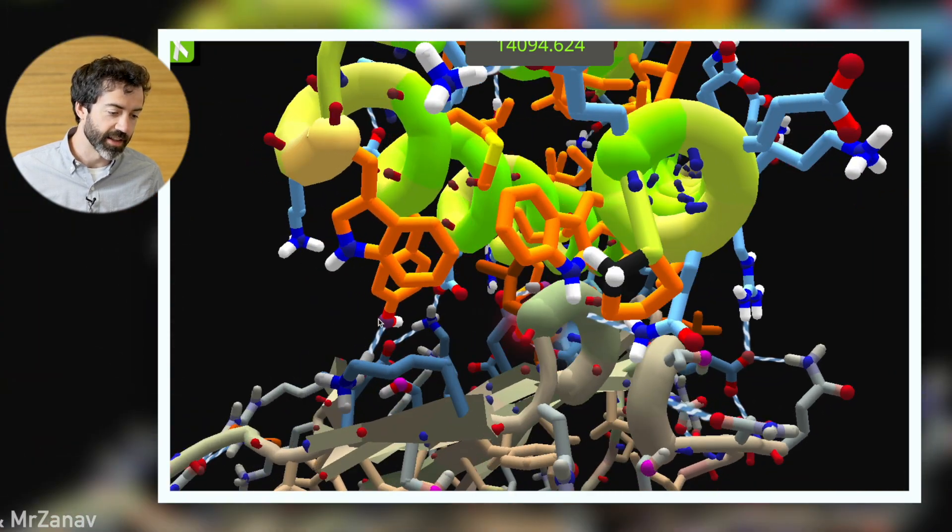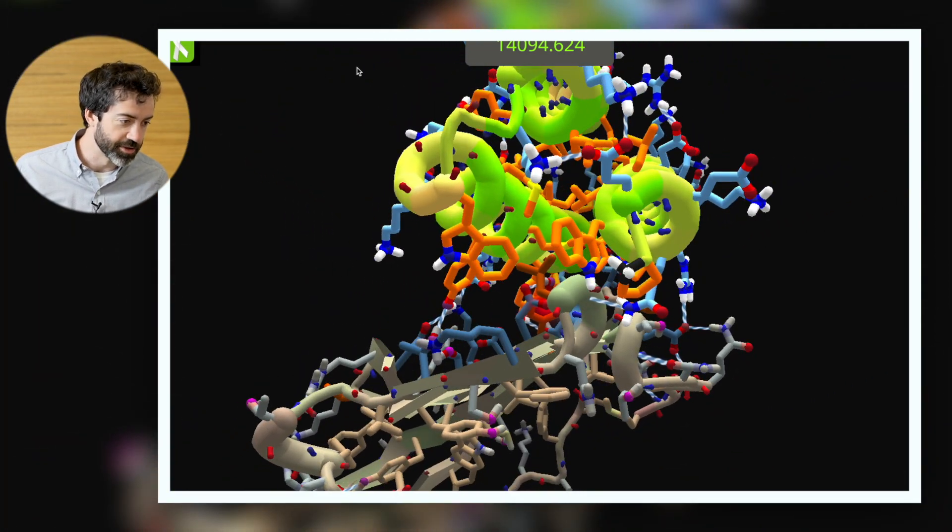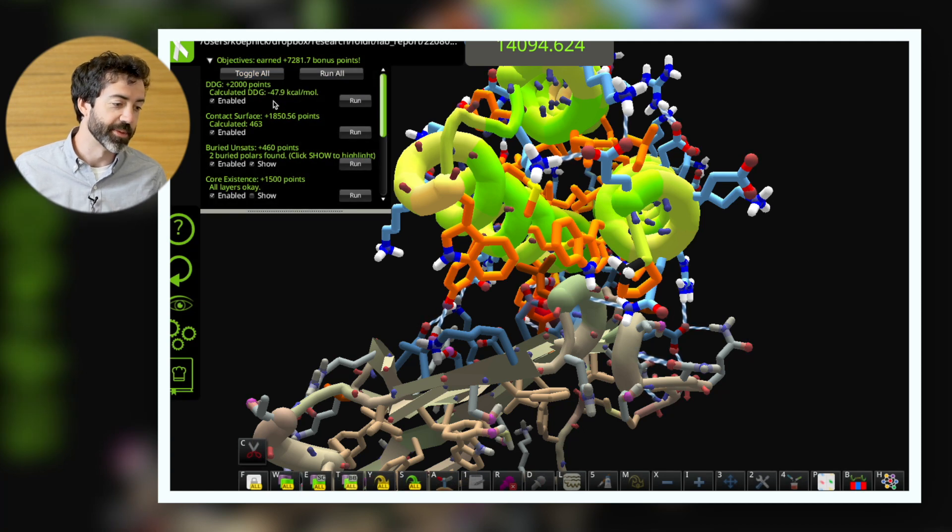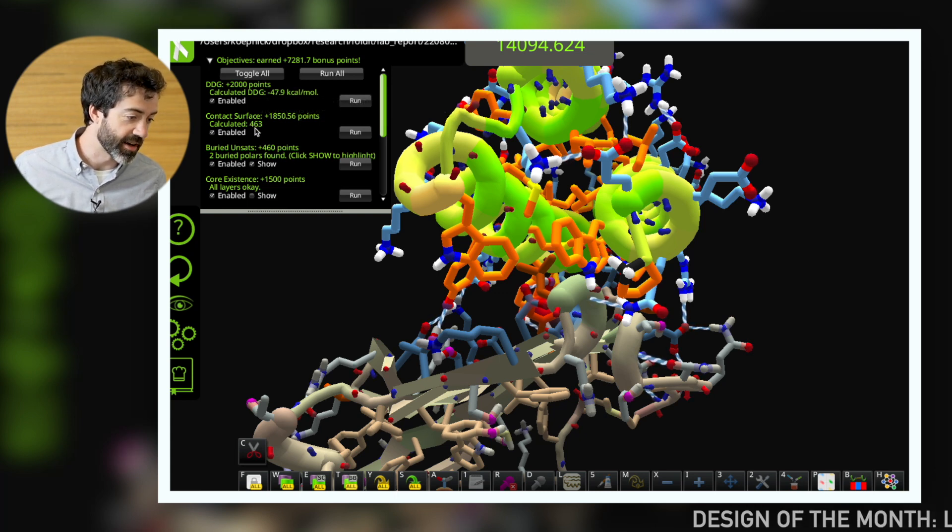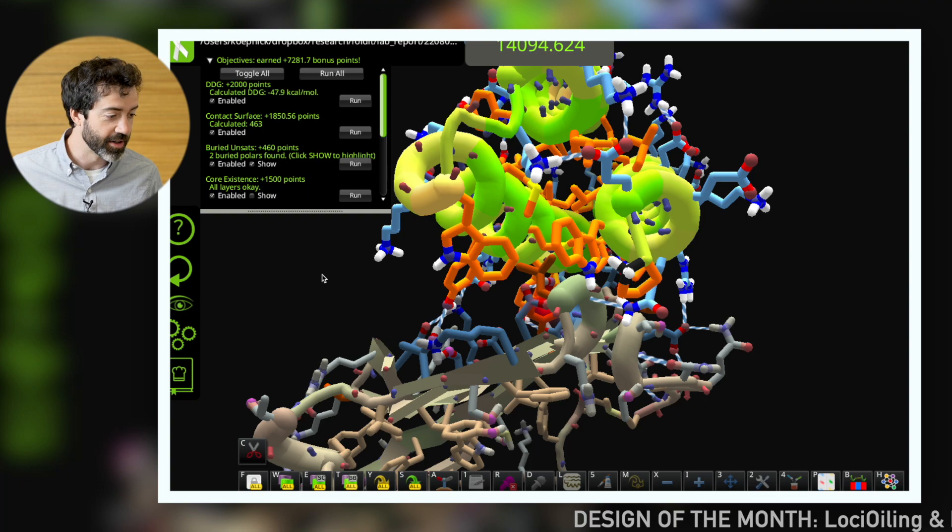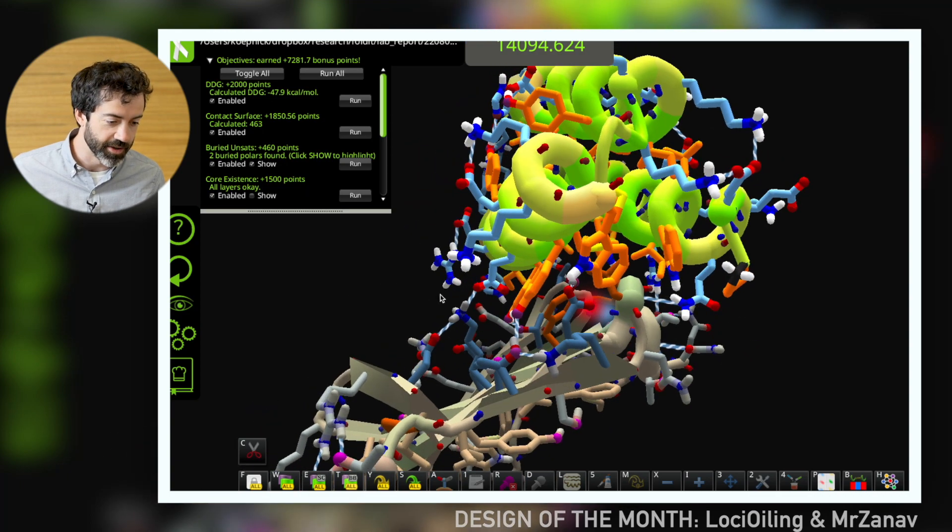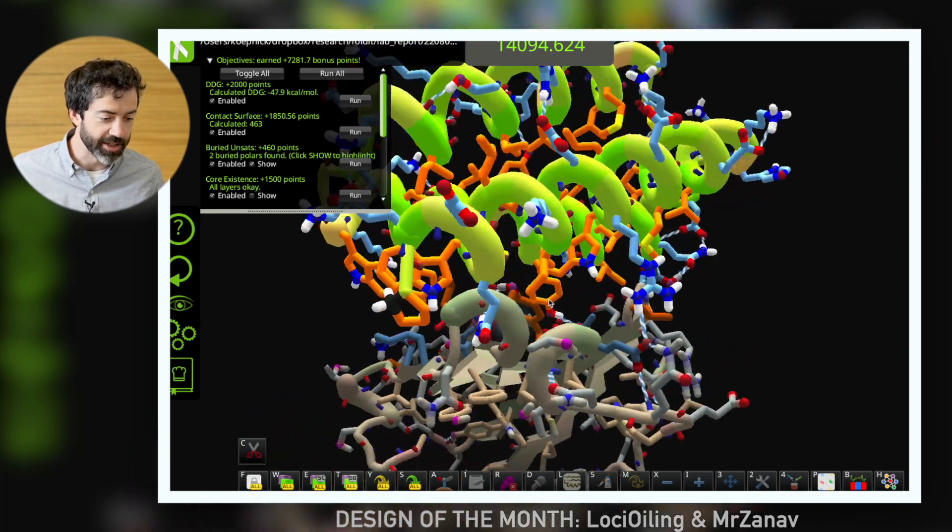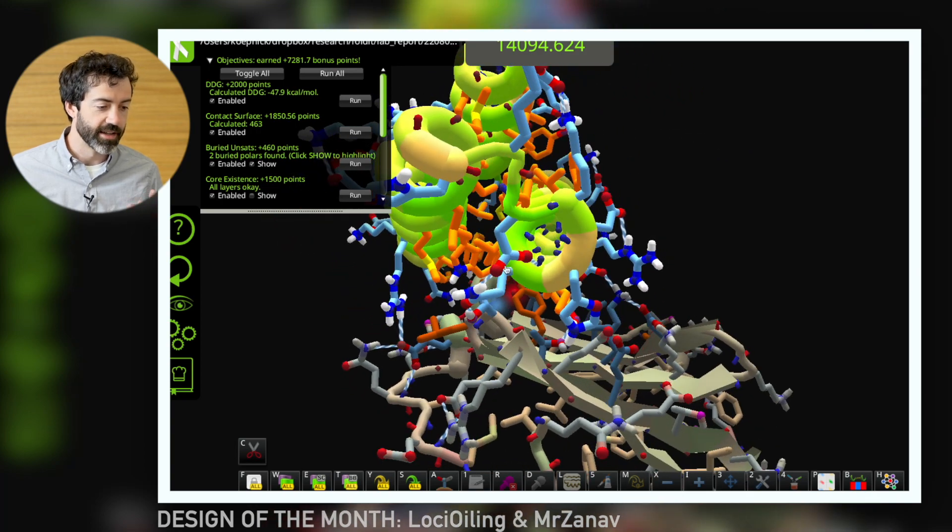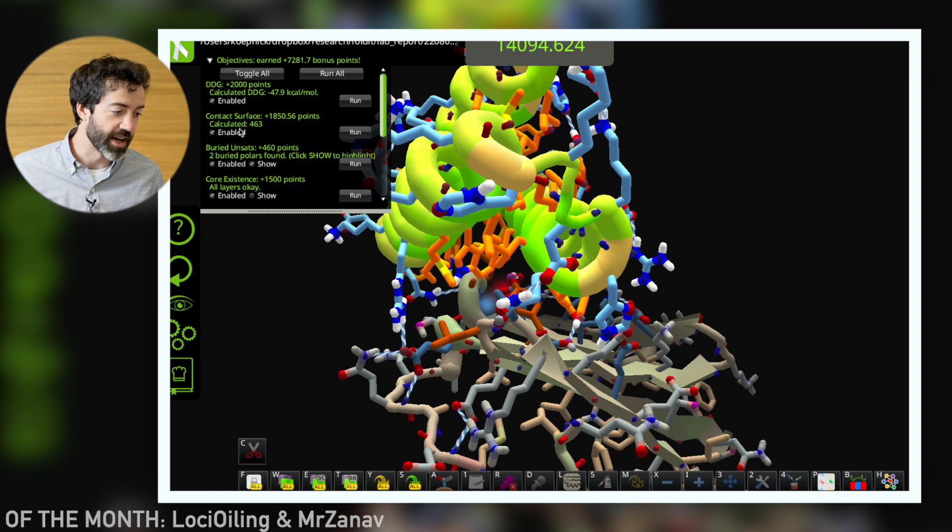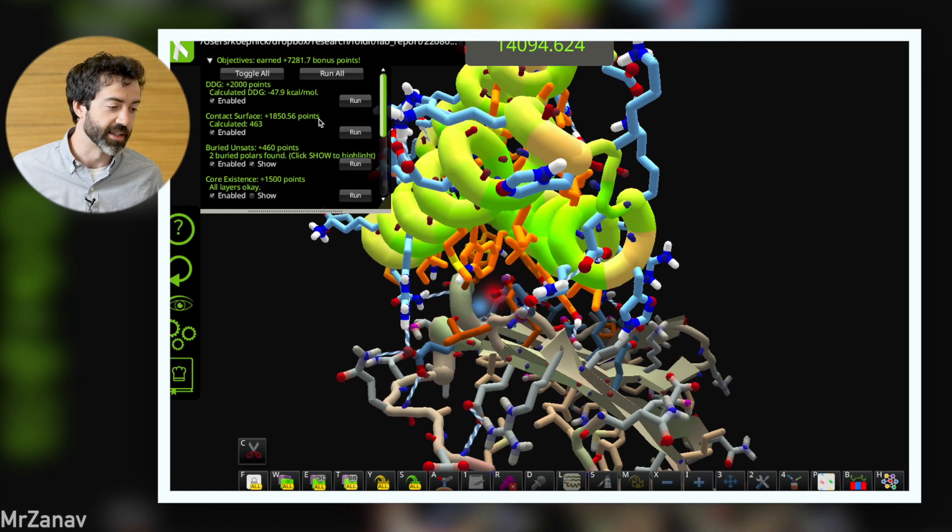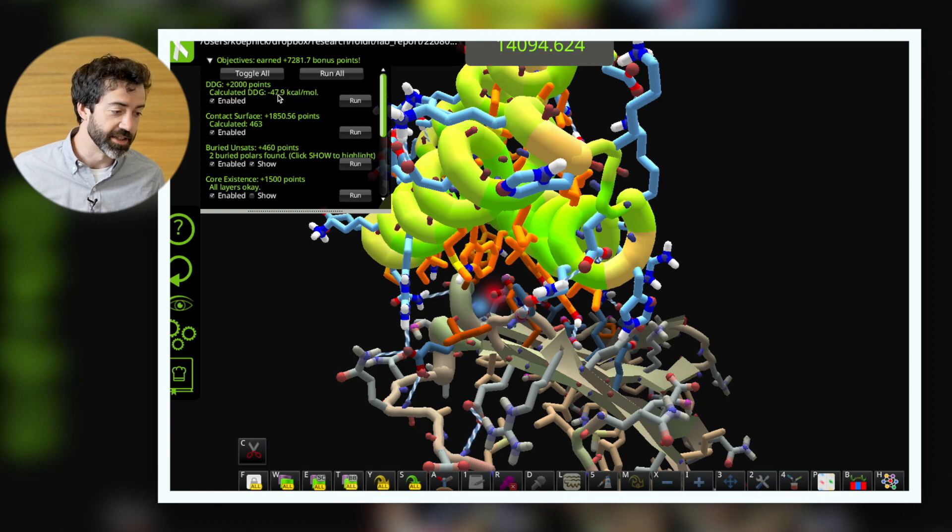The other thing that I would really like to praise about this solution is that we have some excellent binder metrics, a DDG of negative 48 kilocalories per mole and an extremely high contact surface of about 460. So these are very nice binder metrics. We like that this binder makes a complementary shape against the target, which gives us high contact surface. And all of that hydrophobic packing gives us tight binding in this large negative DDG.